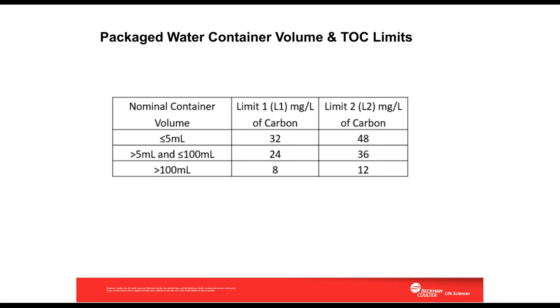And those maximum limits vary according to the container size, as you can see by the table. And just a point of interest, the L2 limits are actually 50% higher, if you look at the table, than those for the L1 limits.